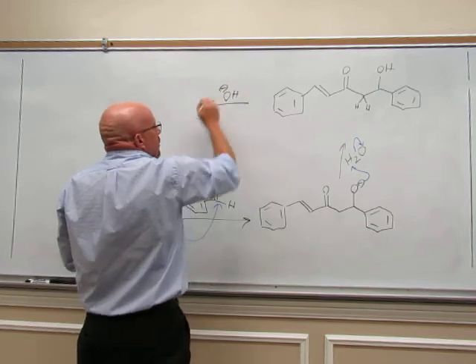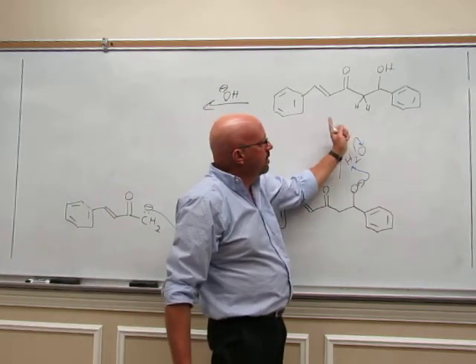So the base, this is our aldol addition product on that side.